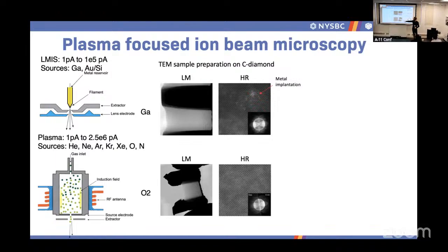If you were to use a very light element, or an element that is gaseous and can simply move out from the sample as the sample goes into vacuum, then you will not be seeing those. You'll be able to optimize the chemistry of your beam for your sample and everything else that comes with it. So generally speaking, you can mill faster and you can mill better.